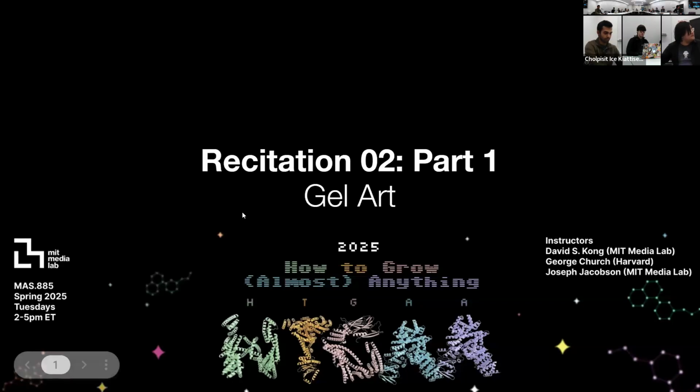So just to give everyone a heads up, today's information is going to be more like a summary of what George and Joe have been talking about. So there'll be a lot of information that we're throwing at you. We're going to get more technical in the way of how do we deal with this DNA? So we'll use the programs, and we'll see how we order DNA through Twist Bioscience, where Emily was also showing you what the technology was capable of.